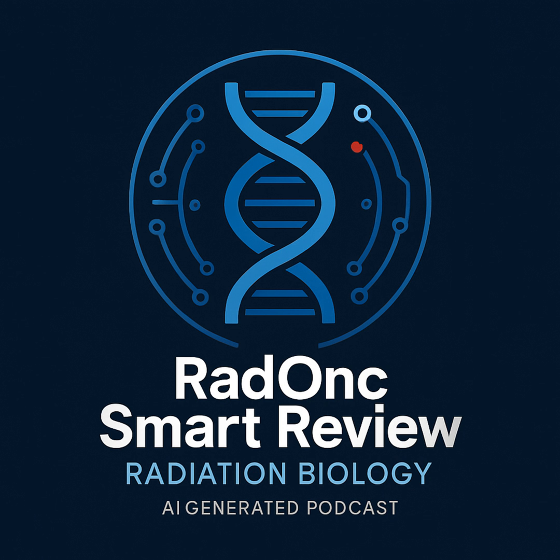Got it. You also need a special enzyme, Taq polymerase. It's named after Thermus aquaticus, a bacterium found in hot springs. Ah, so it's heat stable, thermostable. Right. It can handle the high temperatures needed for PCR without breaking down. It's the enzyme that actually builds the new DNA strands. A heat-proof builder enzyme. What else? The building blocks themselves, the deoxynucleotide triphosphates, or dNTPs: dATP, dGTP, dCTP, and dTTP. A, G, C, T bases. And a buffer solution, just to keep the chemical environment right for Taq to do its best work.